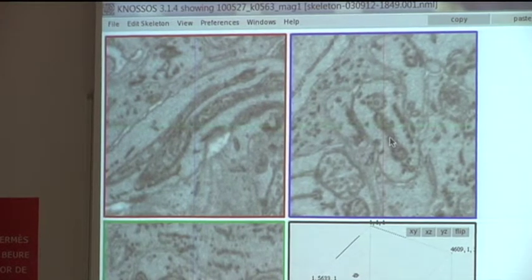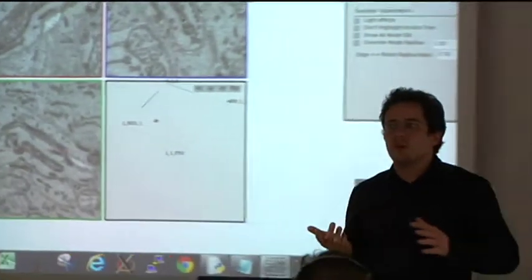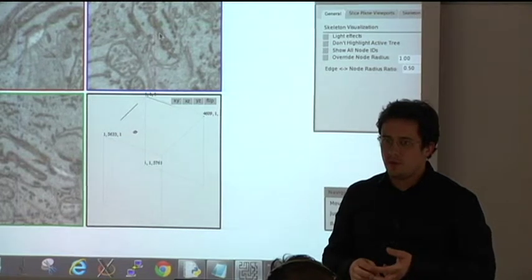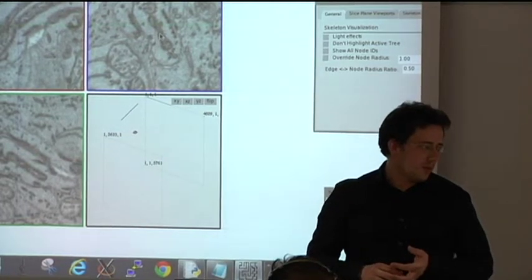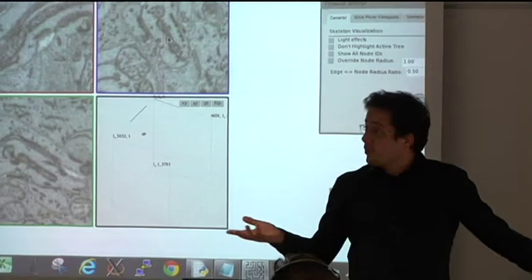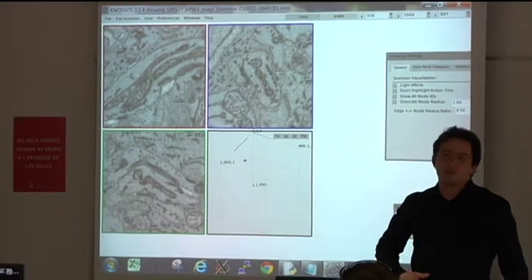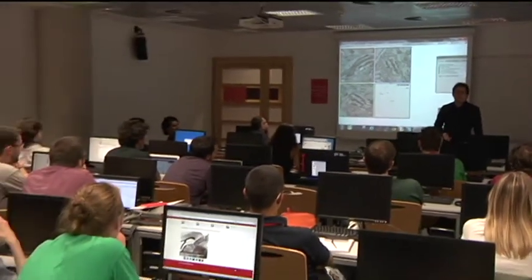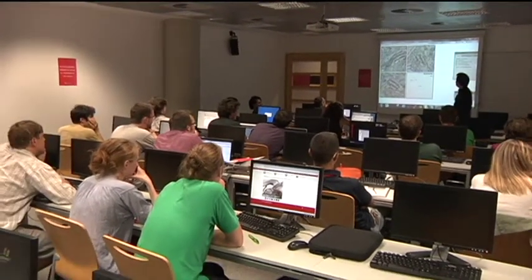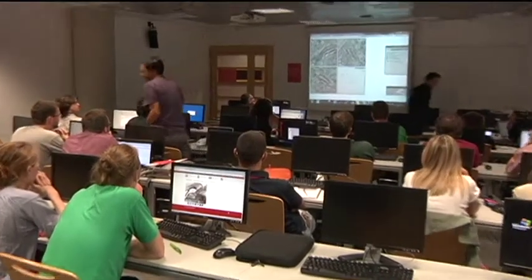So now the task is to follow this neurite here, and there's a speed accuracy trade-off, so you can go faster if you want, but if you miss a branch point, we'll all make fun of that. And so that's what I want to invite you to. So who thinks he can follow a neurite? Or who thinks at least one should try? Or who's at least competitive enough to try it? It's like a game. Come on. Yeah, see. Okay, very good.